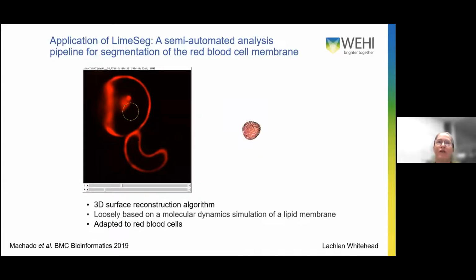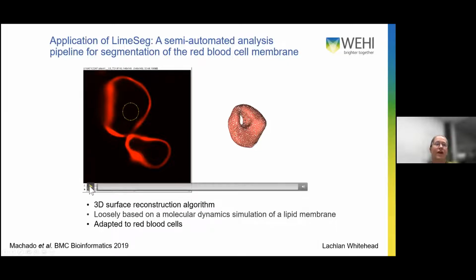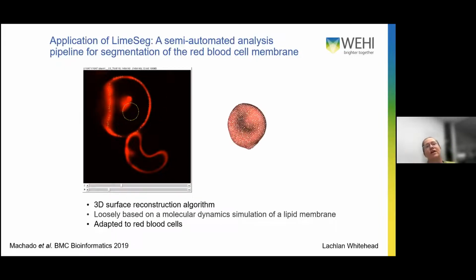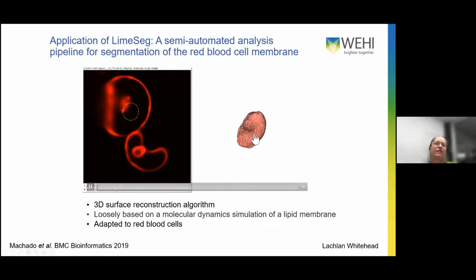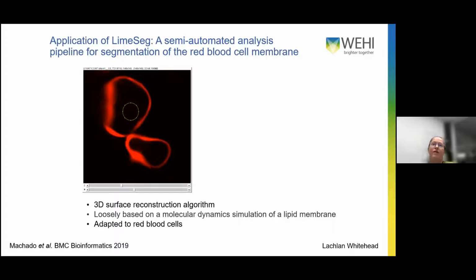And then the other thing I mentioned that wasn't yet really determined is whether the parasitophorous vacuole membrane is formed by the red blood cell membrane itself. Presumably the composition of that membrane may change with some of the contents of the rhoptry organelles that are released. But here, Lachlan Whitehead, who's a physicist in my team, found, just around the same time that we started to do this work, this method called LimeSeg that was published. What that allows you to do is draw a circle on the cell of interest, and then it goes in and identifies the boundaries of the cell. It forms a meshwork on the surface of the cell, which you can see here being formed during the time lapse. And from that, we were able to obtain measurements of volume and surface area.